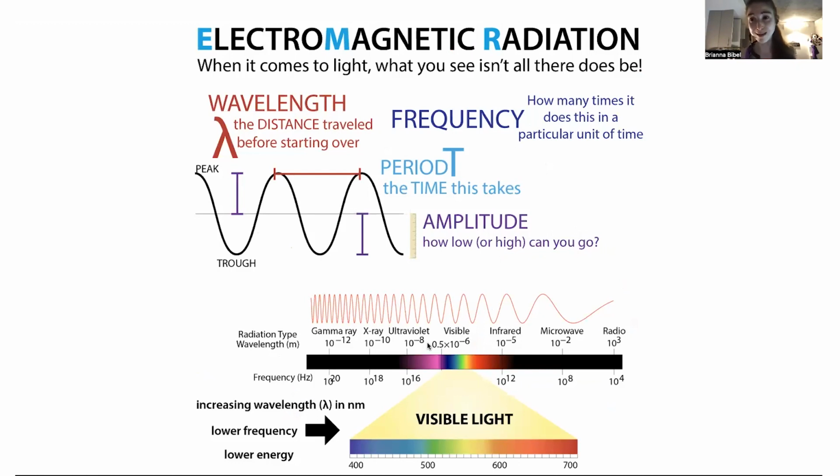So if we think about these light ranges, molecules that we care about in biochemistry, like proteins and nucleic acids, are typically going to be absorbing in the ultraviolet range. We can't see it if they take light in the ultraviolet range. We need special equipment to see that. But we can see it if they absorb in the visible light range. So we need to get them to absorb light that is at a lower energy. To do this, we need something that has a lower cost to excite that electron.